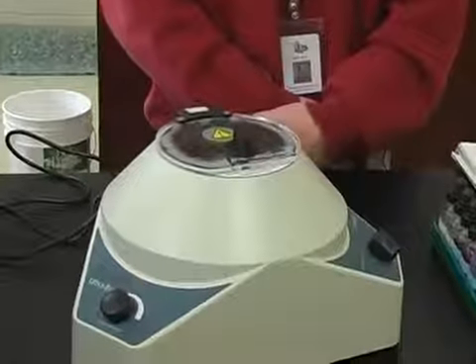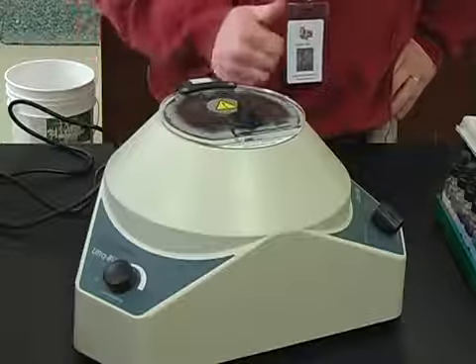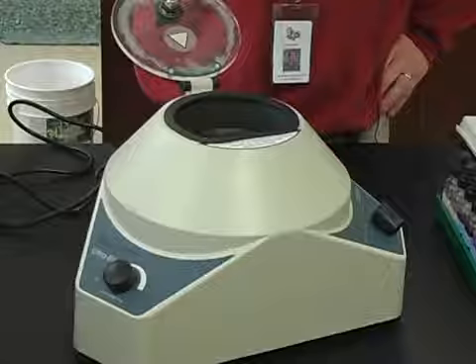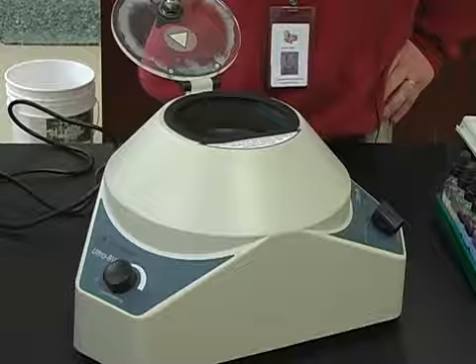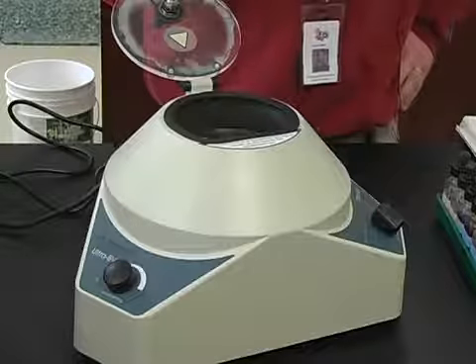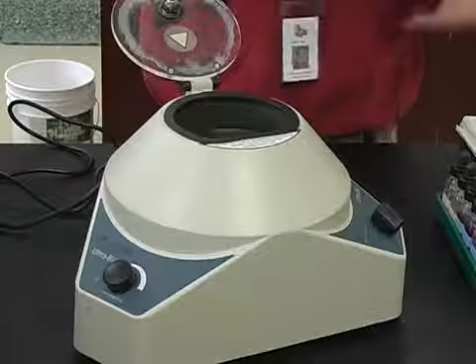Sometimes people do it for longer than that. Make sure that the test tubes stop moving before you open the centrifuge. People, after one day, usually are quite impatient. They'll open the top of the centrifuge, and then they'll start to poke their finger in there to slow the centrifuge down sooner. First of all, it's not real safe, because what happens if you catch your finger on one of the test tubes? Second of all, it might not allow your solution or your solid to settle out quite as nice as it should, and so then all the centrifuging that you did to get your precipitate to the bottom of your test tube is kind of wasted.